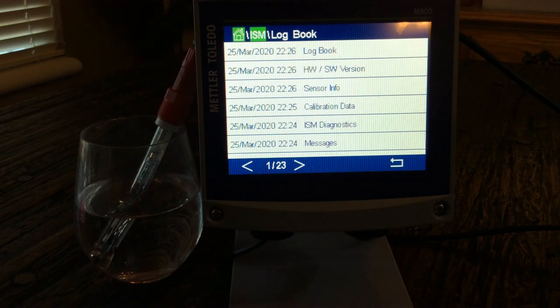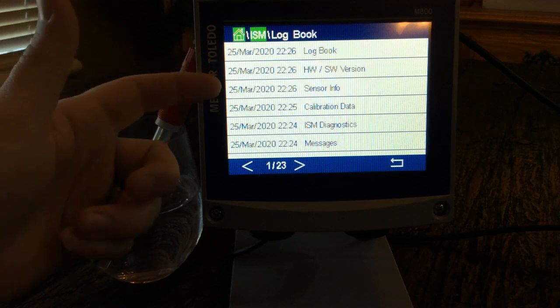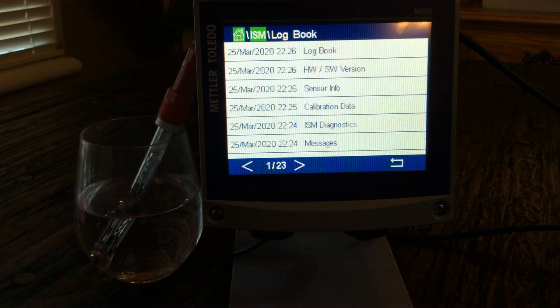The Logbook shows every screen that was accessed — hardware, sensor info, calibration, and so forth — and saves a log every time somebody navigates there. That's key because if you want to make sure someone is actually out there calibrating and checking the sensor, that's where you'd confirm it. I've seen cases where nothing was done; opening the logbook confirms whether any work has been performed.